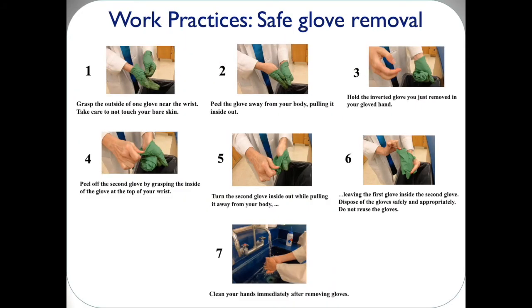Removing gloves properly is as important as wearing them when you need to. To keep whatever might be on the gloves from splashing onto you as you remove them, peel the glove away from your body, pulling it inside out. Hold the inverted glove you just removed in your gloved hand.